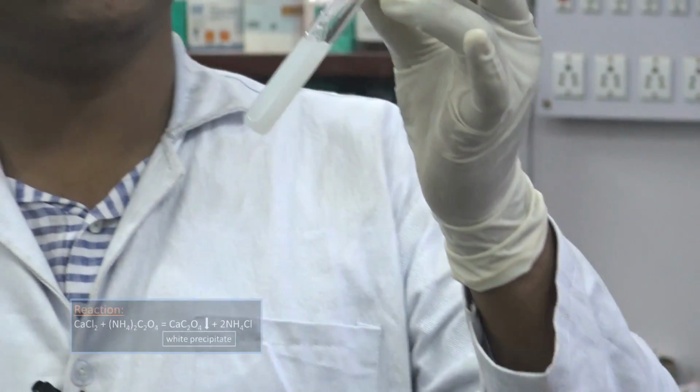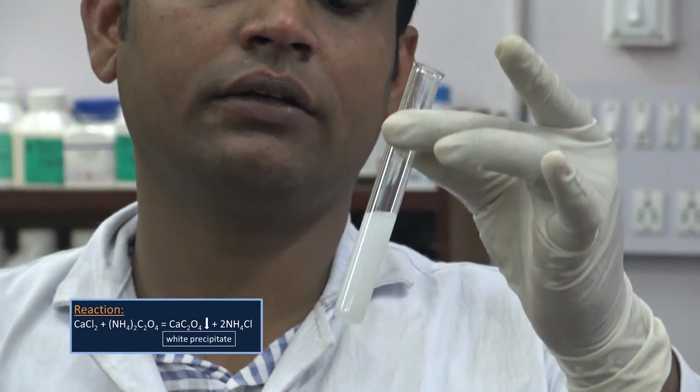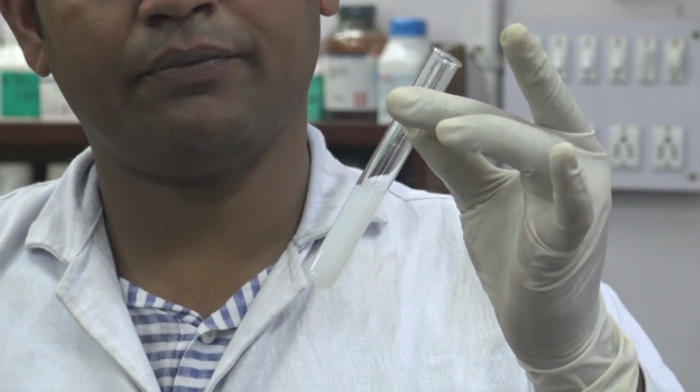Hence, the formation of the white precipitate on addition of the ammonium oxalate, which is insoluble in concentrated acetic acid, confirms the presence of calcium ion.